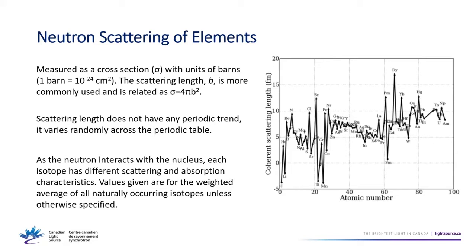And neutron scattering is measured by a cross-section with a unit of barns. So that's just like a big red building on a farm. Same thing. Because I guess the story is that apparently it was a lot larger than they thought it was going to be when it was first measured, so they said it was as big as a barn. Anyway, that's the story I've heard. So a barn is actually still quite small in terms of area.